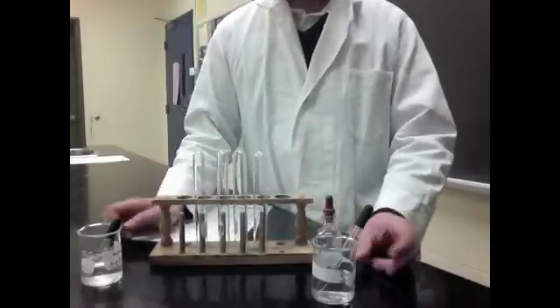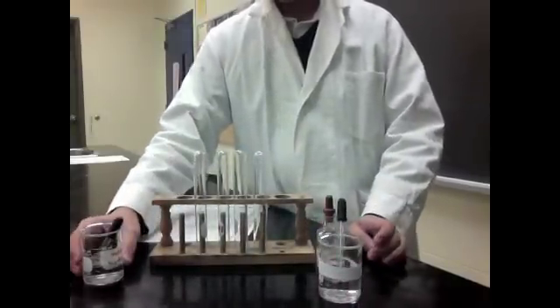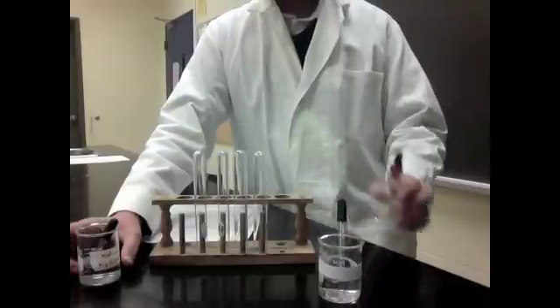You will need test tubes, sulfuric acid, sodium hydroxide, and phenolphthalein.